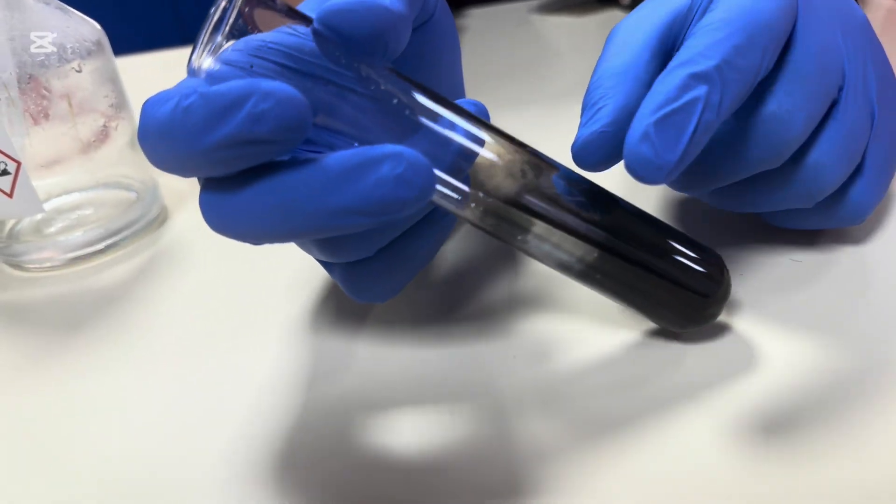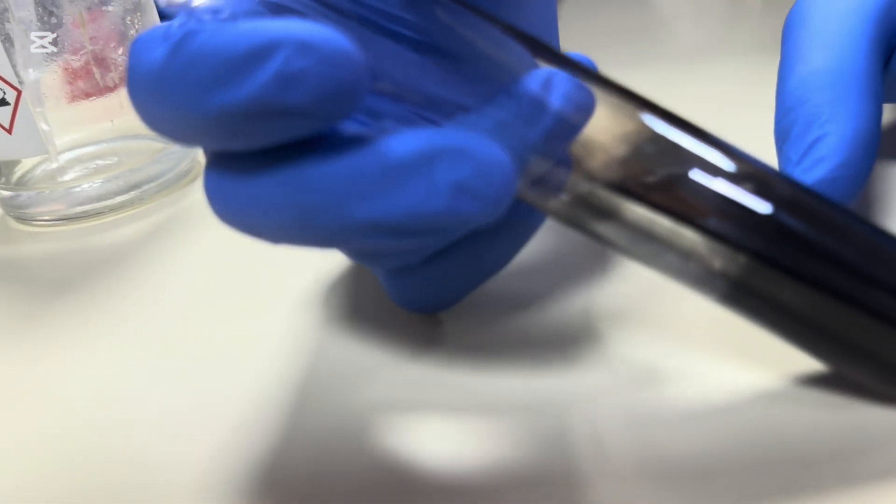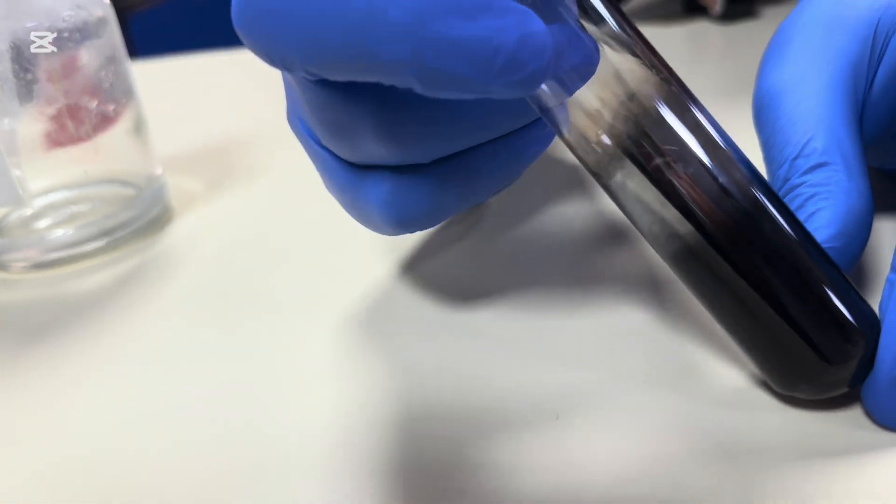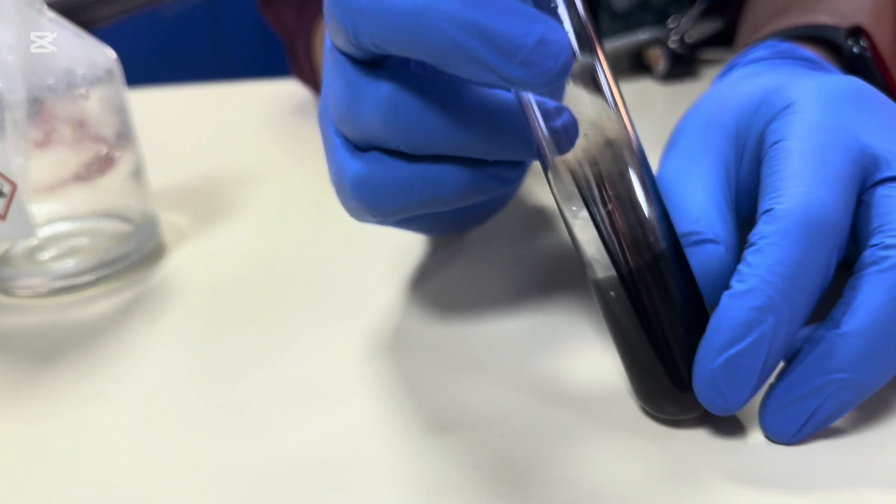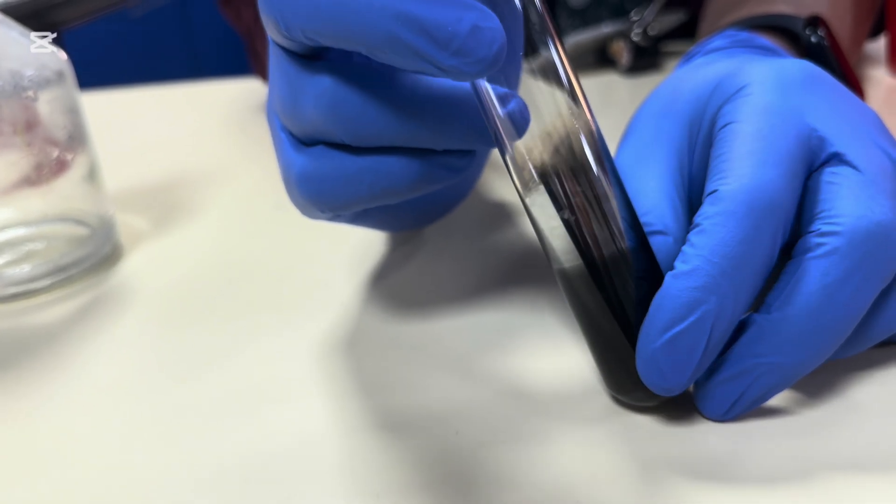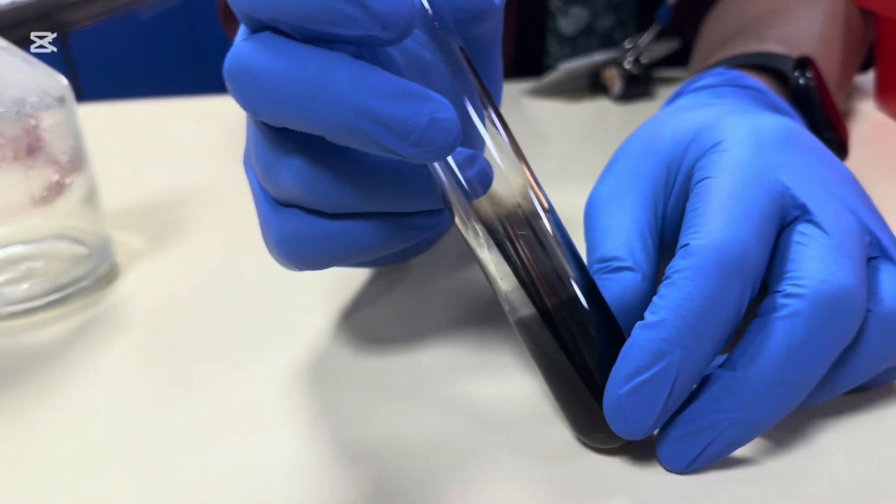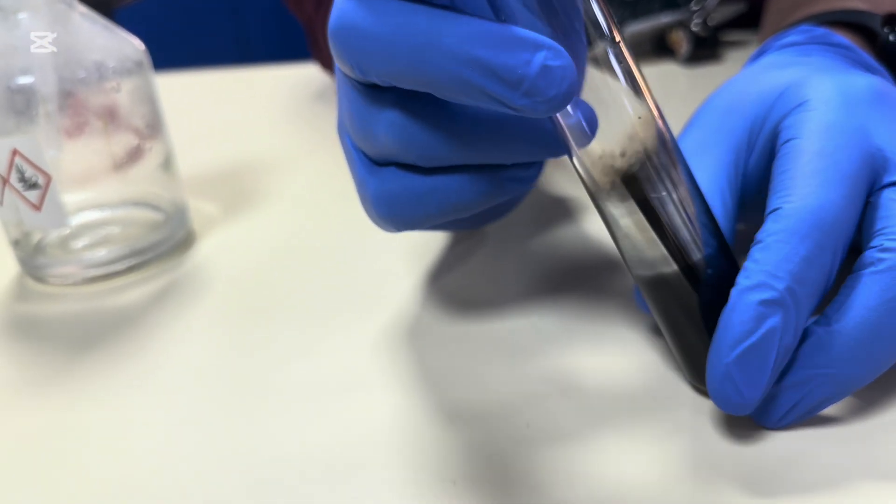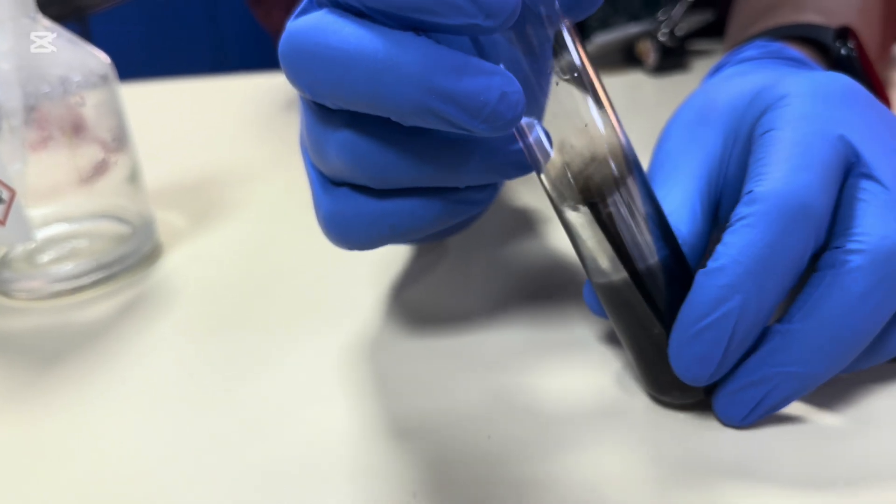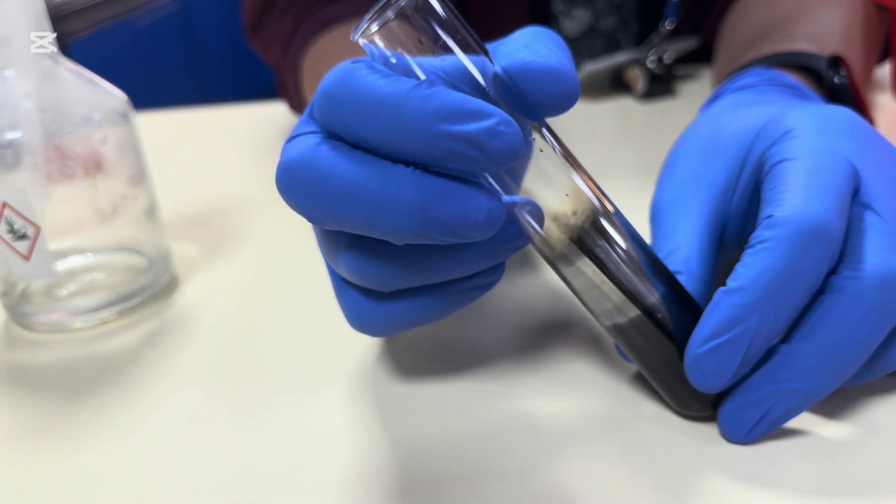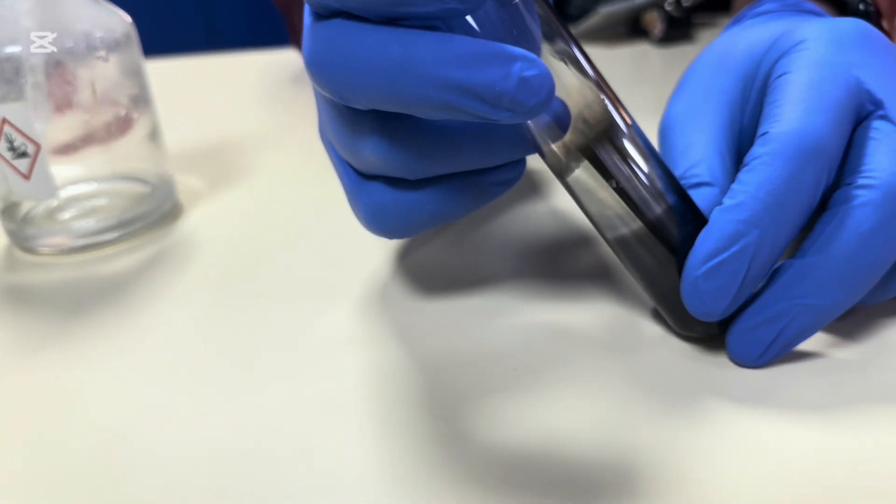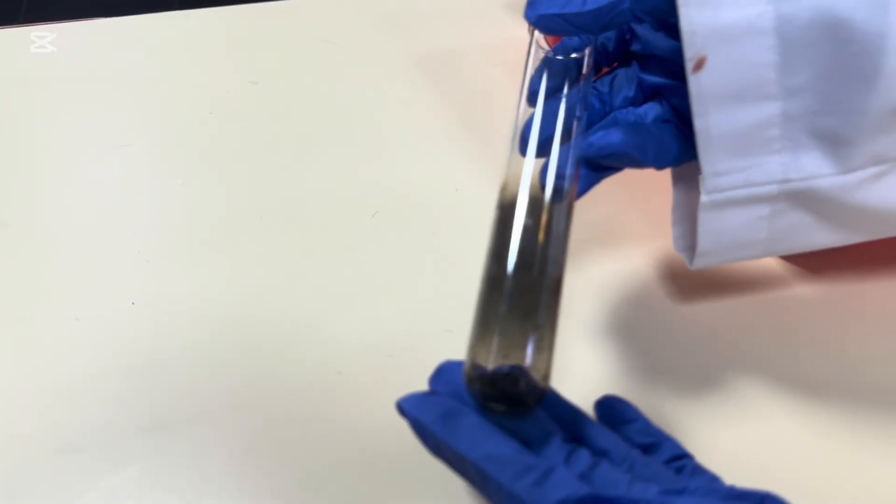But it's what's forming here that's very interesting. Can you see anything? Yeah, the silver on the walls. Silver. So it's like a mirror. Hence the name silver mirror test. So this is complementary test that there is the aldehyde from our mixture. Very cool.